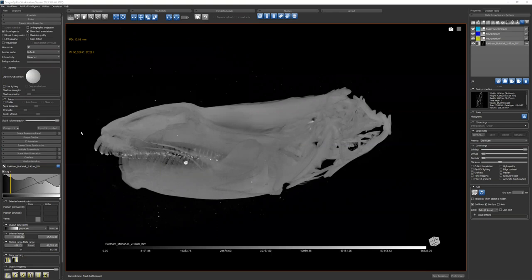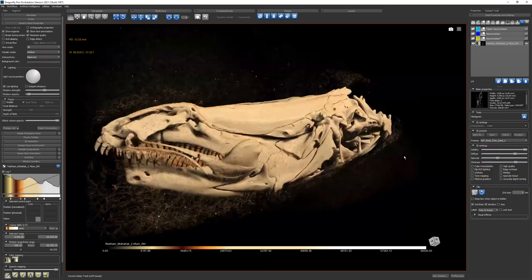So we have foam. Dragonfly has the ability to use some presets, and then you would change them here. So I have one I've made. Makes it look a little different. Each preset can either use, or each LUT, so this is a lookup table that's over here. I think it's called that because this range of the data, you look up the color. I'm not sure why it's called lookup table.